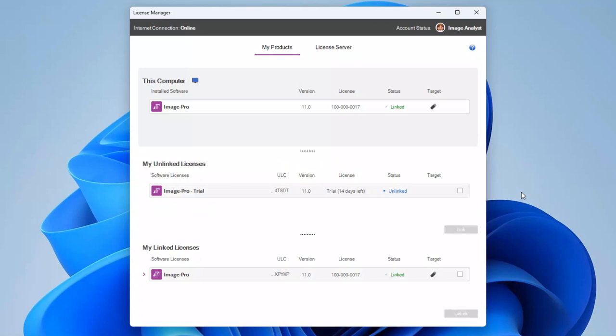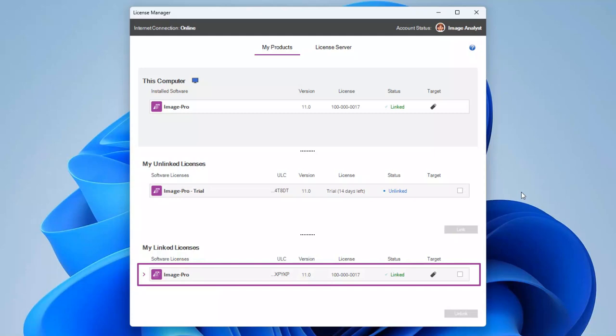After a short delay, the License Manager updates and your license bundle is displayed in the My Linked Licenses table. This time, the dongle icon is shown in the Target column.